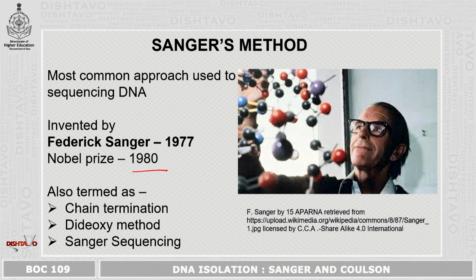Now, Sanger's method of DNA sequencing is also called as chain termination reaction, dideoxy method, or Sanger's method, students, named after the inventor Frederick Sanger. It can be known by any of these three names, students.